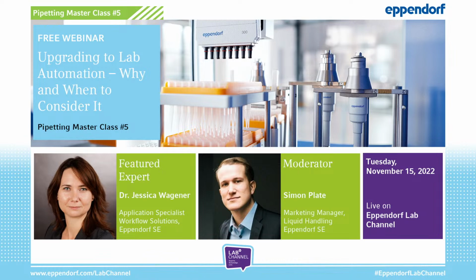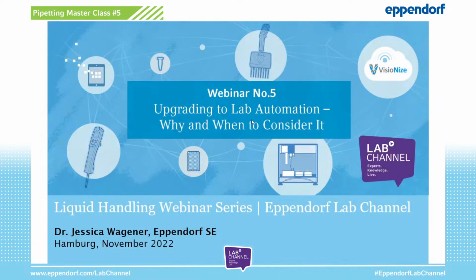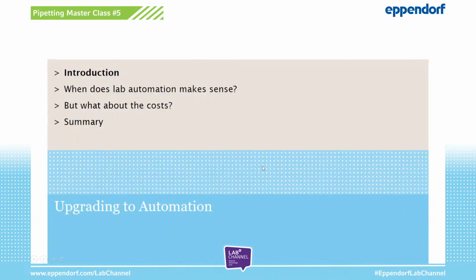Thank you so much, Simon, for the introduction. And yes, so let's start with the presentation. Thank you again for joining us today. In the last episodes of this webinar series, we heard a lot about how to optimize manual pipetting with regards to the handling of different liquid types, the choice of pipetting tool, and the optimal pipetting technique. Today, we are talking about the benefits of automation and are looking into the applications and workflows where automated liquid handling platforms can support your daily work in the lab.